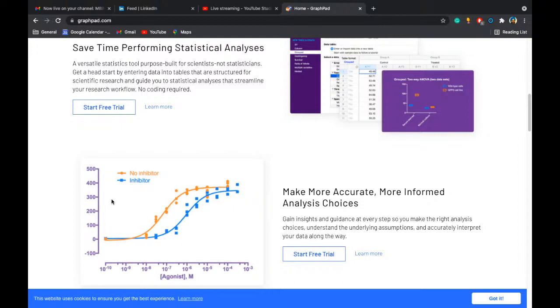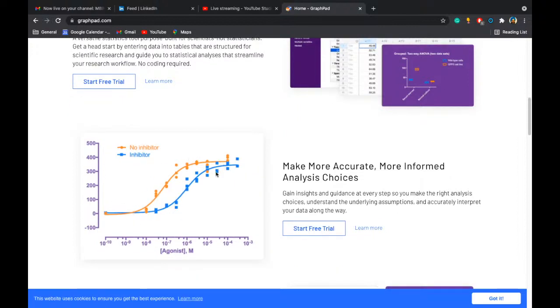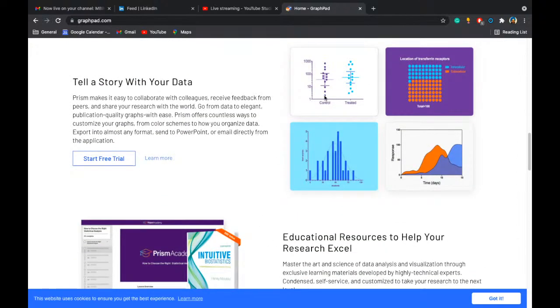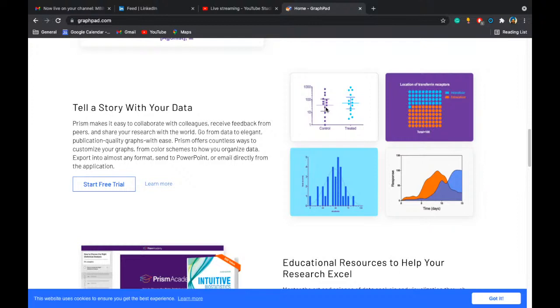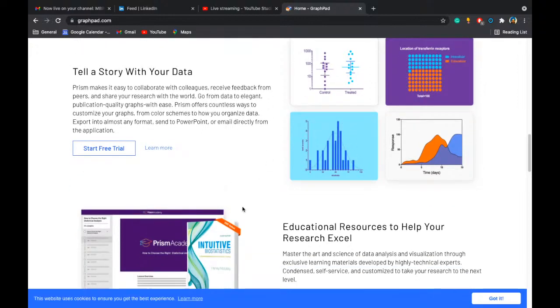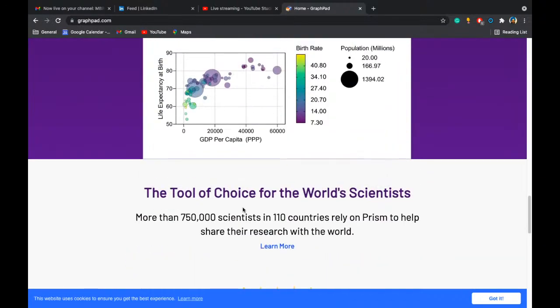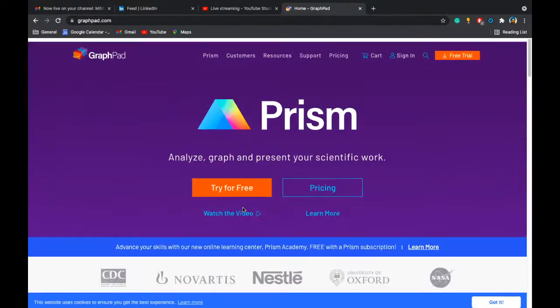This will make your graphs very nice and paper presentable. The blue lines are with inhibitor, and this is the non inhibitor, and this is the y-axis, this is the x-axis. In order to check the mouse samples, mouse treated and control, in this way we can group them to identify the peaks and how things are going on. It's a multi-purpose software and makes your life easy.